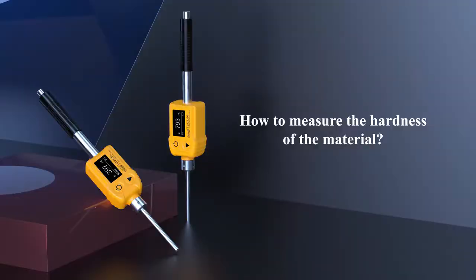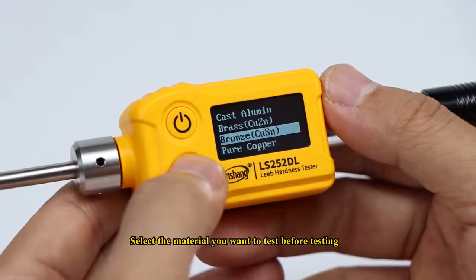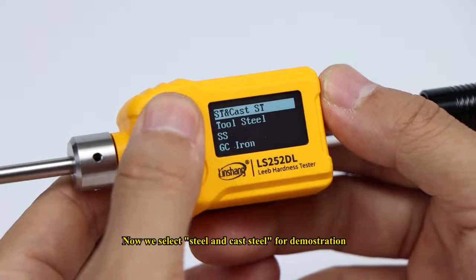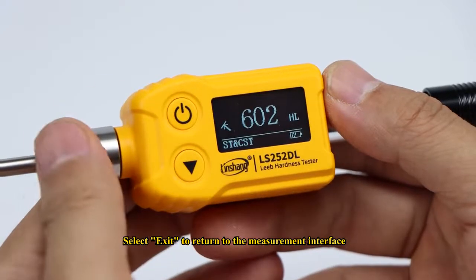How to measure the hardness of a material: Select the material you want to test before testing. Here we select steel and cast steel for demonstration. Select exit to return to the measurement interface.